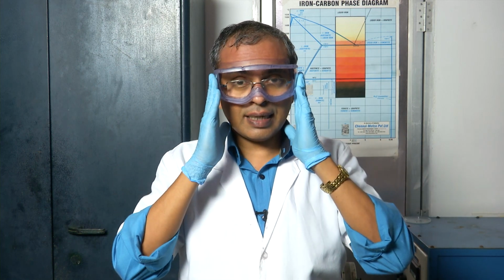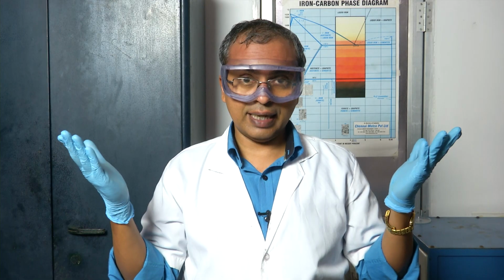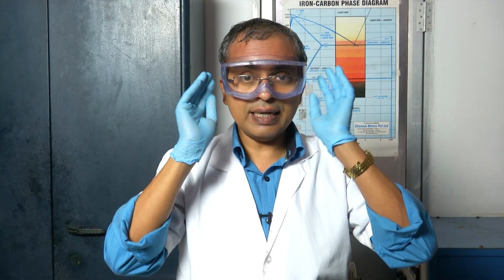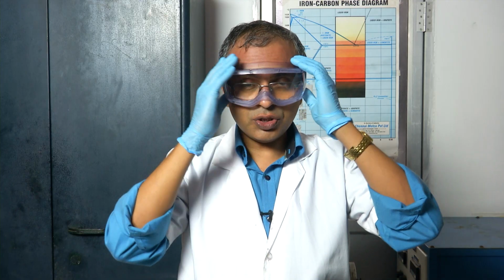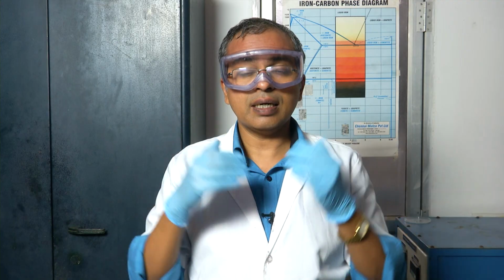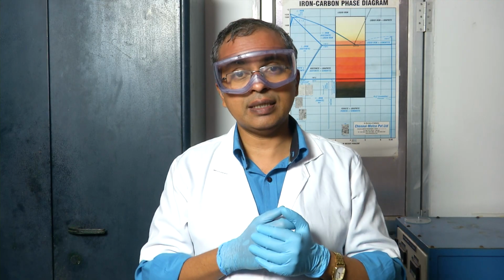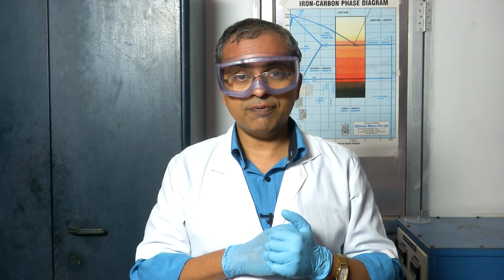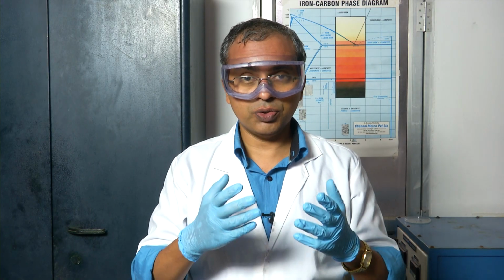And these glasses are available in a variety of different stylings. Some of them actually have well defined and well directed porosity that ensures that some amount of cross flow of air is there without compromising the protection that it provides to you from the perspective of a spill. So, these are some safety devices that are prevalent. I will show you some more.